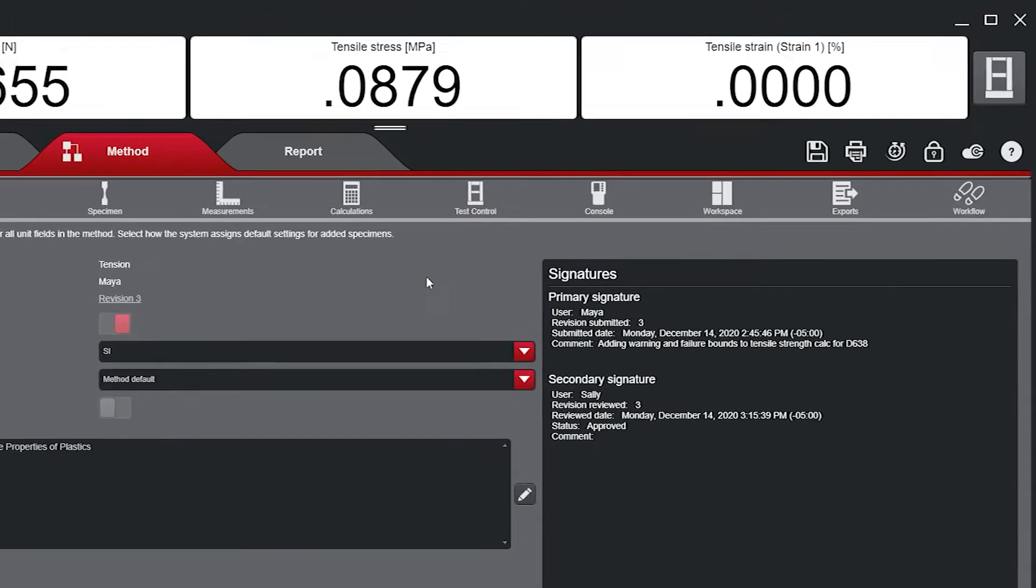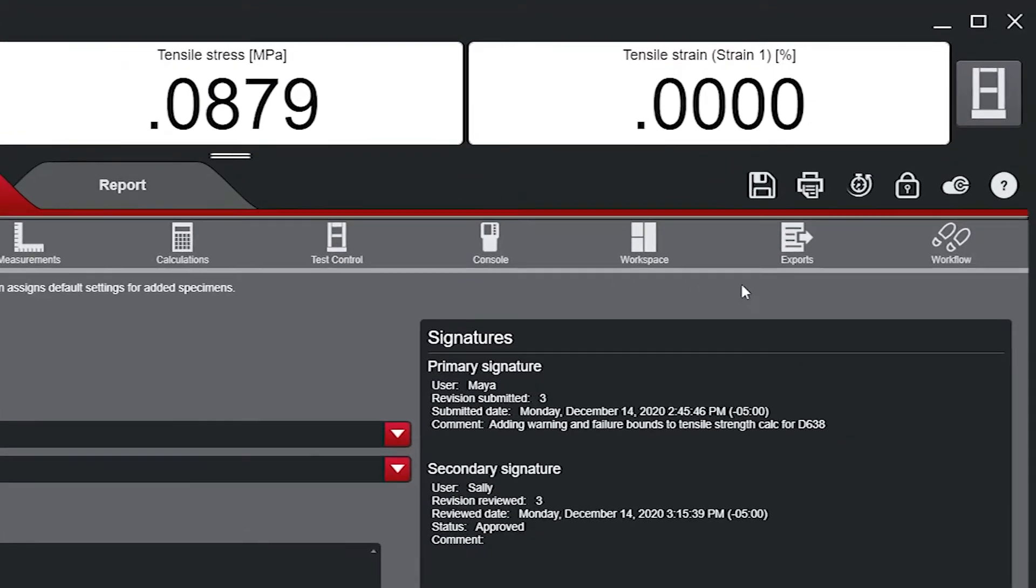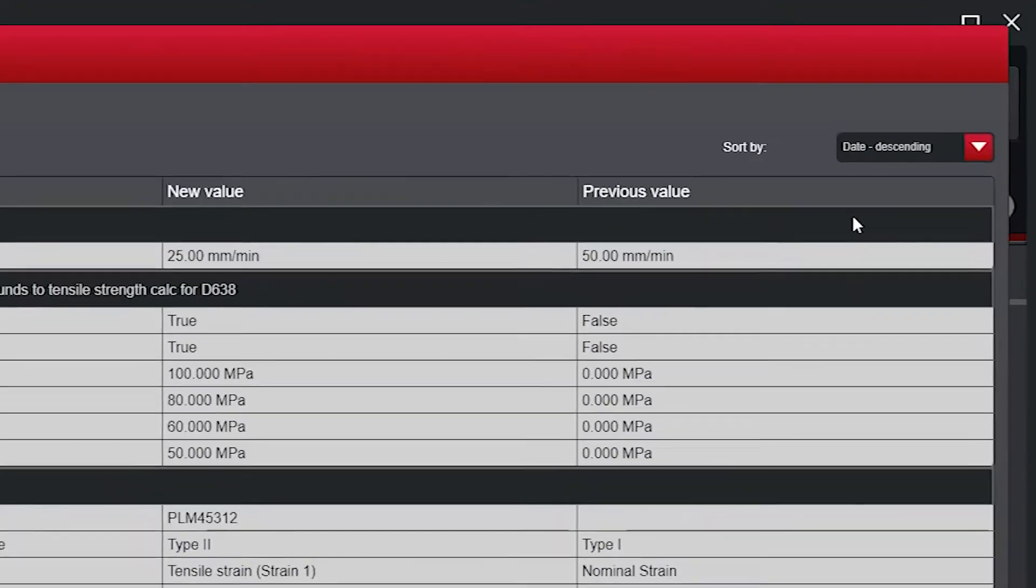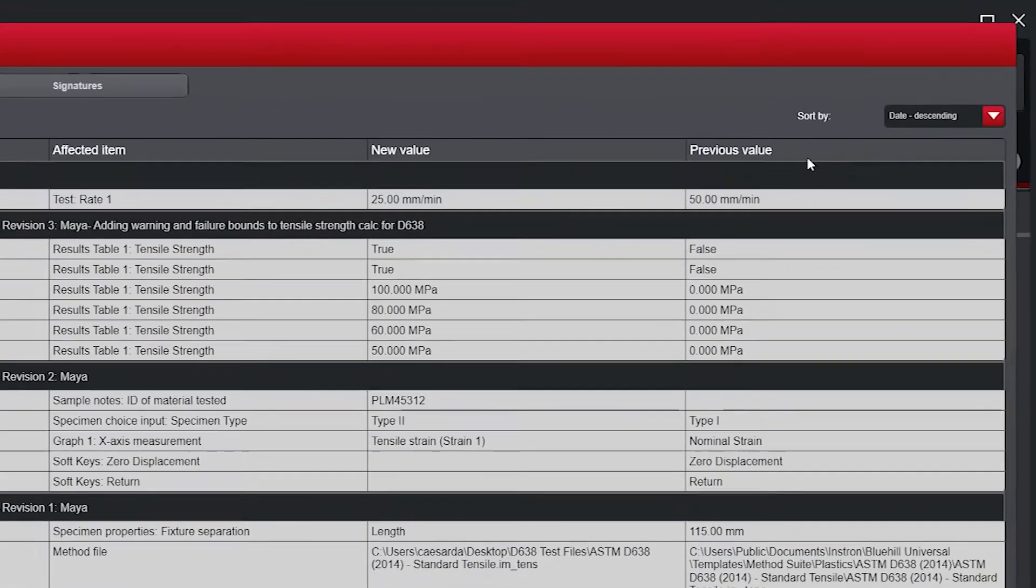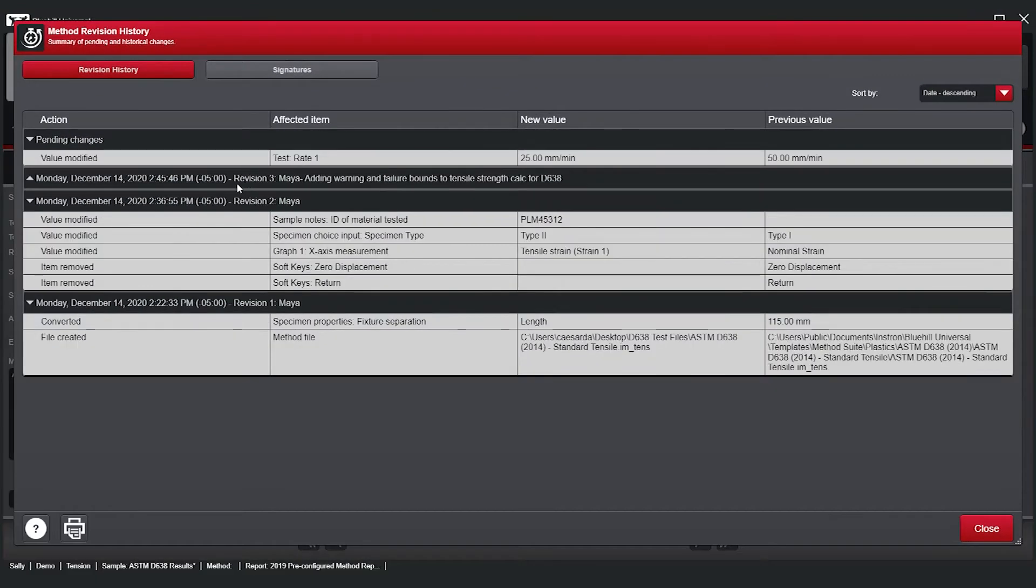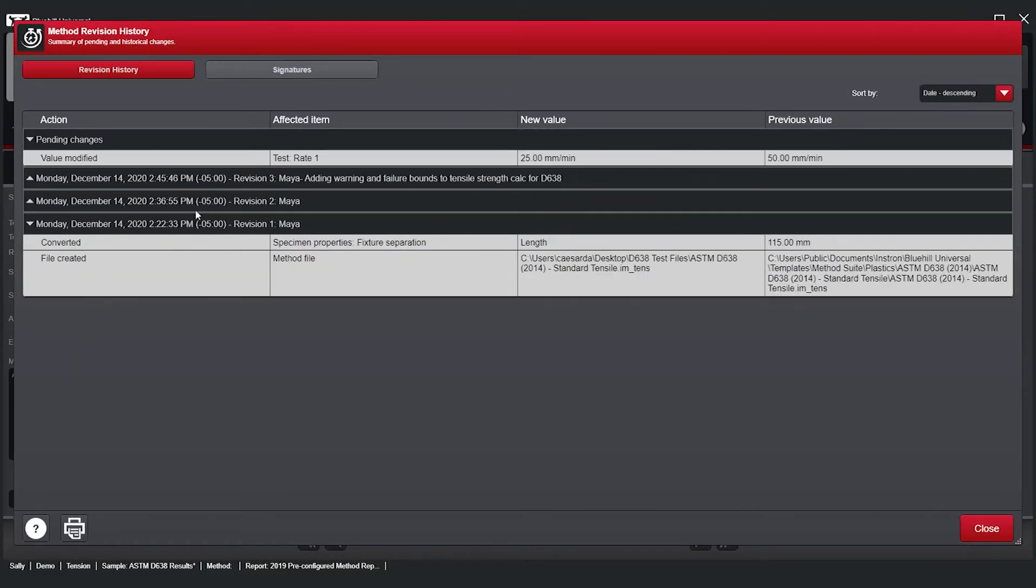To view the full history of a method, users can open the revision history log to see each change back to the method's creation. Each revision contains the details of its affected item, including a timestamp, both the new and the previous value, as well as the name of the users who made the change.